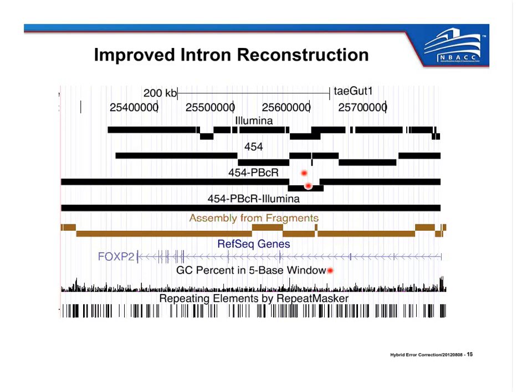When we look at the Illumina assembly, we see that it's more fragmented than the Sanger assembly, which is expected. The other thing we see is that there are several gaps where either the contigs were too short to be accurately mapped to the gene, or we didn't have any contigs in our assembly. So you're not only fragmenting it, you're missing some intronic information. So this is very difficult if you're doing analysis and you're interested in the introns. You're maybe missing parts of the story, and it's very hard to know that you're missing these parts if you didn't have a good reference or a good close neighbor.